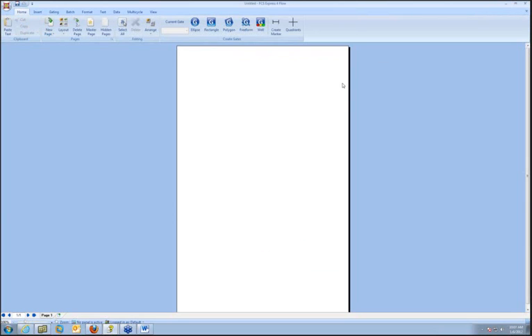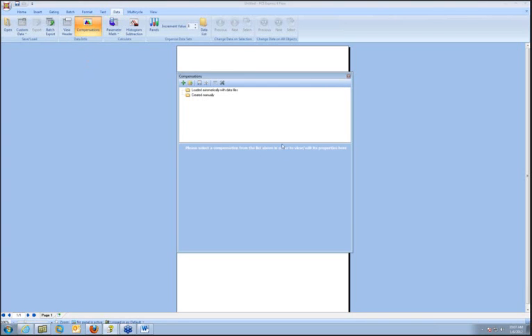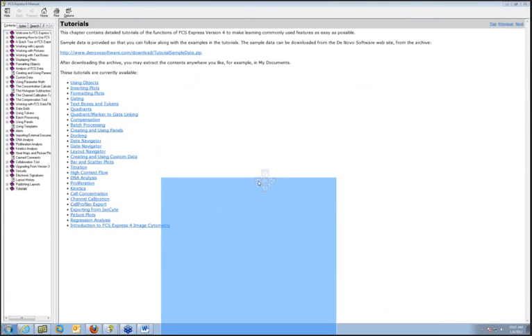What is brand new is the entire compensation user interface, and you find that user interface under the Data section of the ribbon, under Compensations in the Data Info. And when you open up that compensation, you'll see that it's now a dockable window. You can move it around like all our other docked windows.